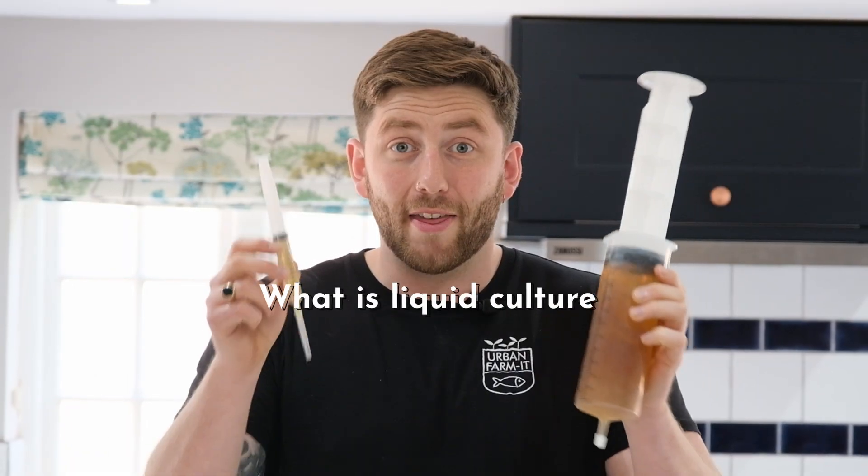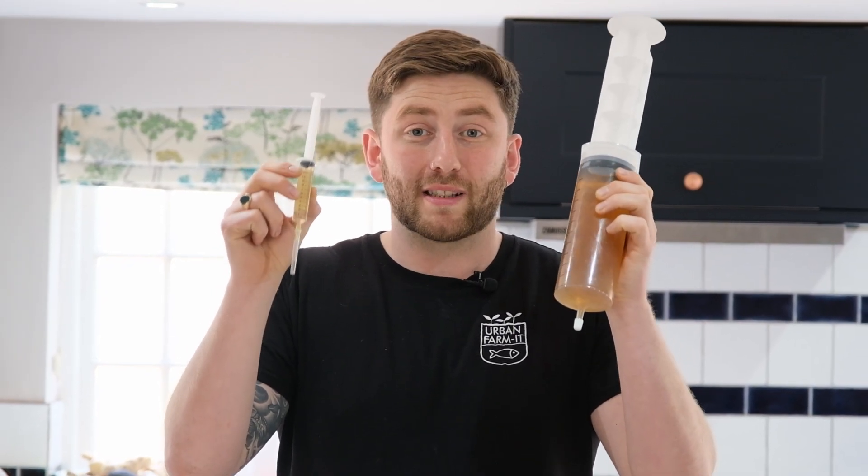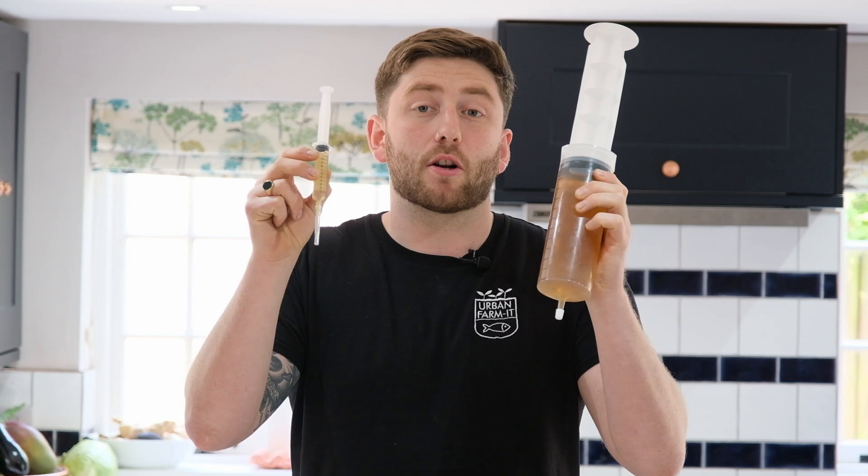Most mushroom growers are really familiar with mushroom grain spawn. What they often don't realise is that it comes from liquid culture, one of the earliest parts in the mushroom cultivation chain. And this is liquid culture — it is just a nutrient broth with mycelium living inside it, and it's what we use to inoculate our grain spawn.